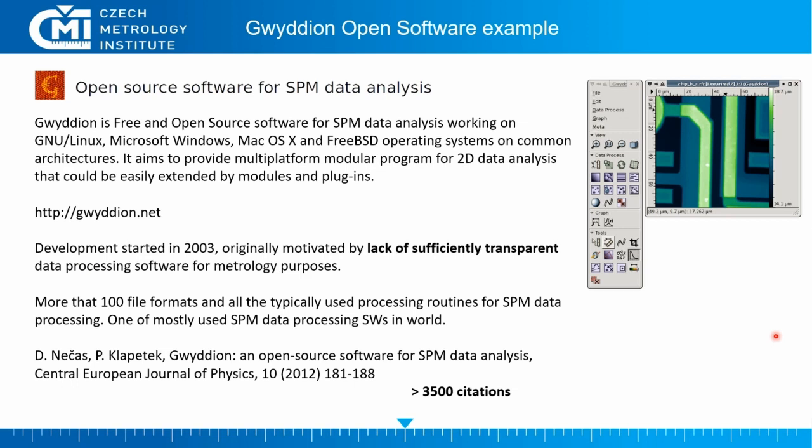And together with David Nečas from SEITEC, we have been developing this software since then, and it is now quite widely used. It supports a lot of file formats, and it can be used for nearly everything you might need when you have your SPM data and you want to process them. Therefore, it's one of the most used SPM data processing softwares in the world, I would guess. At the moment, we are getting about 1 citation per day for this software. So we think making something open can also bring some kind of scientific outputs in terms of scientometry, which is something that we didn't expect at the beginning at all.